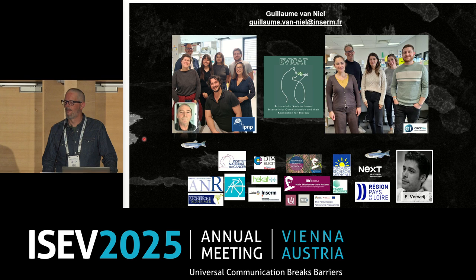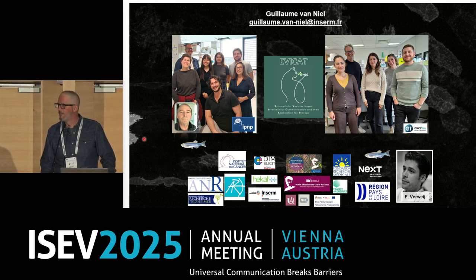Thank you very much for your great talk. So I have one question. Some of the EVs have a very high autofluorescence, so what kind of dye do you think has the highest signal-to-noise ratio? So you're talking about autofluorescence of EVs? Yes, so if you label the EVs, you should be able to tell that the fluorescence is specific fluorescence, not from the autofluorescence of the EVs.